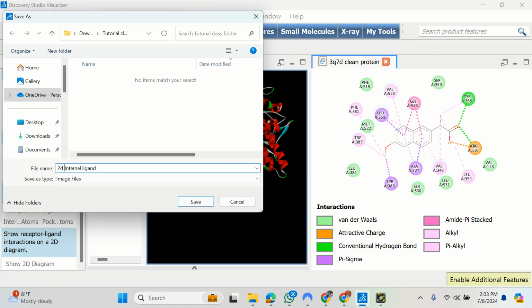When you start working, after docking, you're supposed to check and compare this to what you have. If you don't have this, remember there's a possibility that you have a false result. This arginine 120 will be here. You won't be interacting with your ligand. You keep screening your ligand until you find one that is interacting with it. That one that is interacting with it has a better pose than the rest that are not interacting with it.